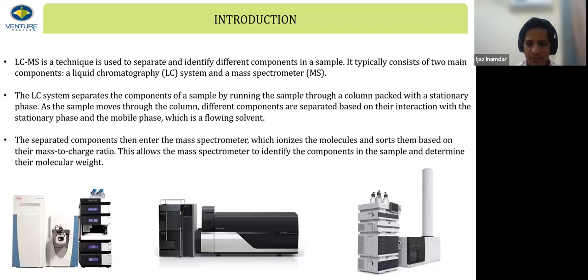Most of you, if you have some exposure to a typical analysis lab, know that HPLC is one of the most important pieces of equipment that we use, at least in the pharma domain. So we know the principle, and we are going to talk about the principle as well.